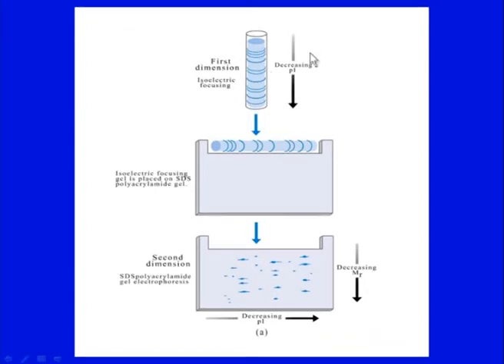If you do not want to stain, that is also all right, but one time you can see that it is doing well. Then you will lay this gel and it will run. You have run in this direction and now it will run in this direction, at 90 degrees to the previous run. You have put it on a stacking gel and then it will run. It could be a gradient gel, step gradient or continuous gradient gel, where the pore size will decrease as you go along.